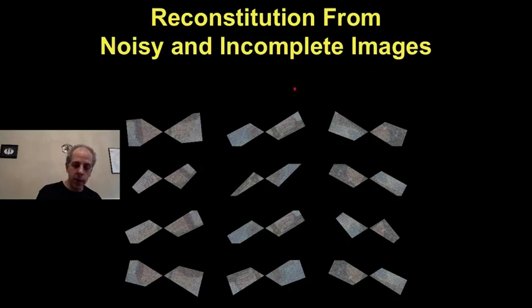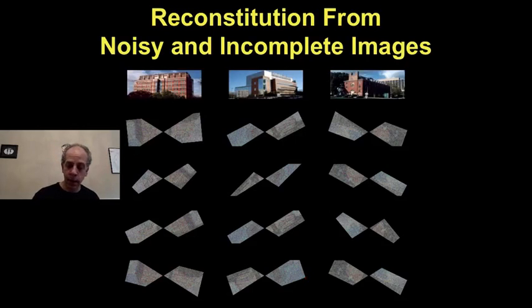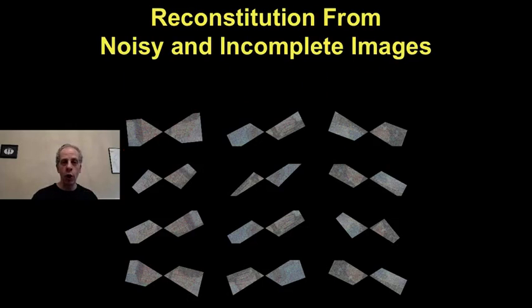So, somebody gave you this. Very noisy data with missing data, the missing wedge. They didn't give it to you organized in columns. They're all unorganized. So you have to be able to group the ones that came from basically the same building. Here, we have to group back. Here, you have to rotate back, and all that from this noisy data with a lot of missing information.